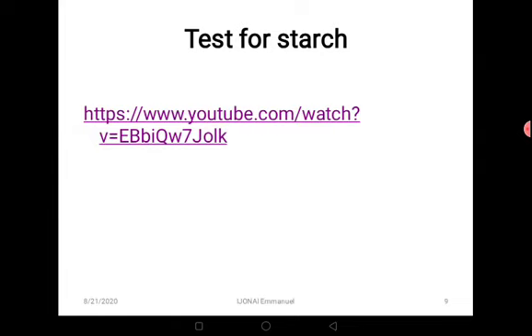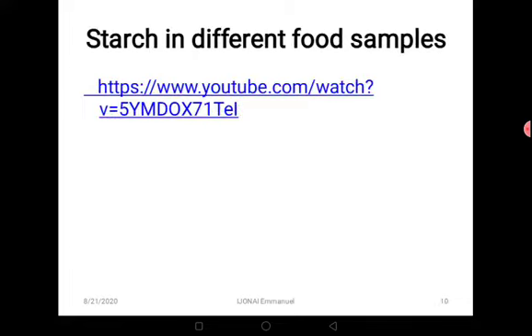So you can see now how we can test for starch in our laboratories. Remember, we are using iodine solution, and iodine is brown, but when you drop it into a solution containing starch, it turns to either black, blue-black, blue, or brown with black specks, depending on the quantity of starch. At our level, we are also encouraged to quantify the foods that we have found. That's why we say moderate, little, much, and so on.